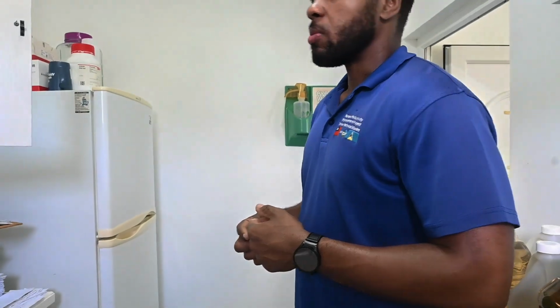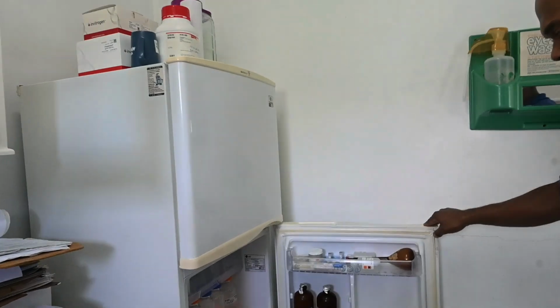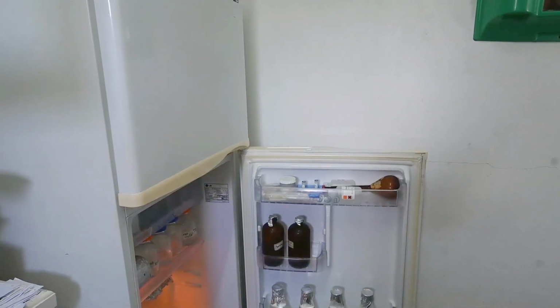to ensure that the water is as close to pH 7 as possible. That would make it easier for us when we are adjusting the pH, so we can find our baseline for the plants, which is between 5.4 and 5.8, because we're working with subtropical plants, and that's the range in which those plants grow best. When we create the stock solutions, all dissolved in distilled water, they are stored in the refrigerator to maintain the integrity.